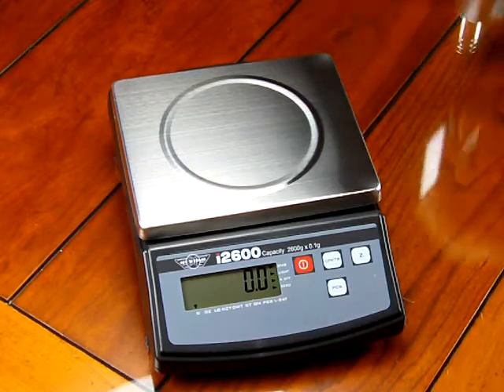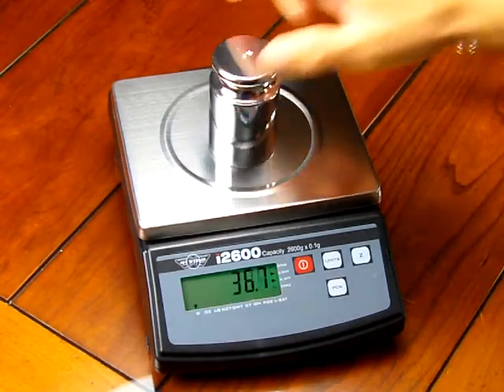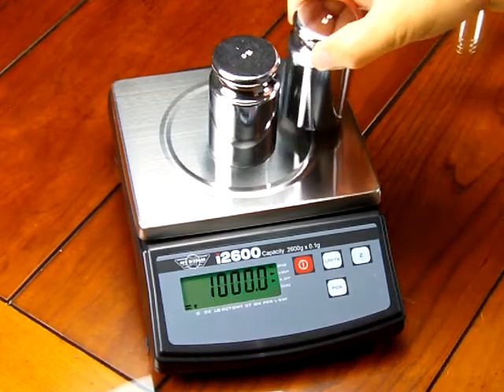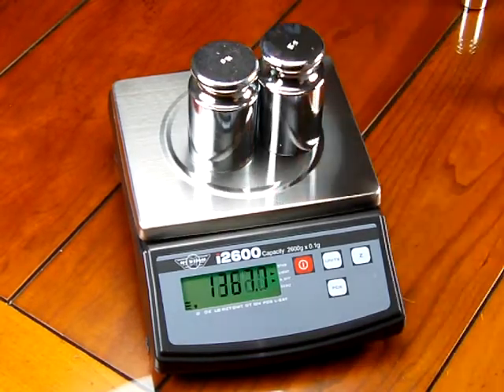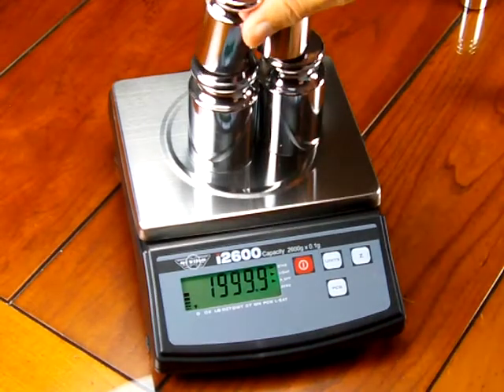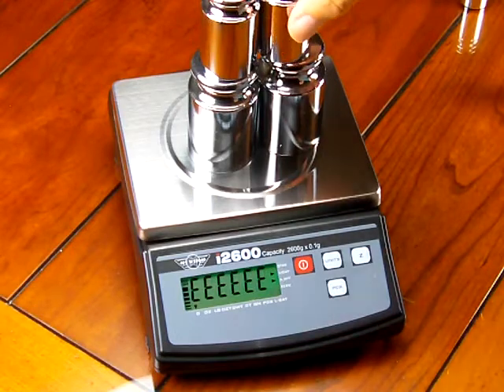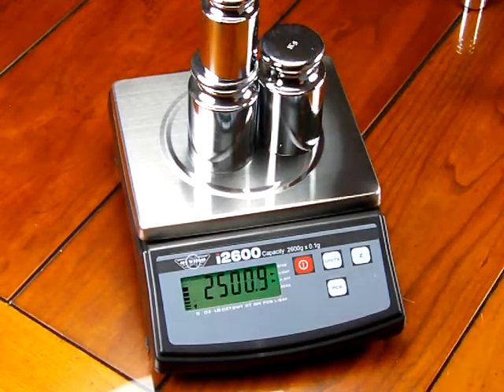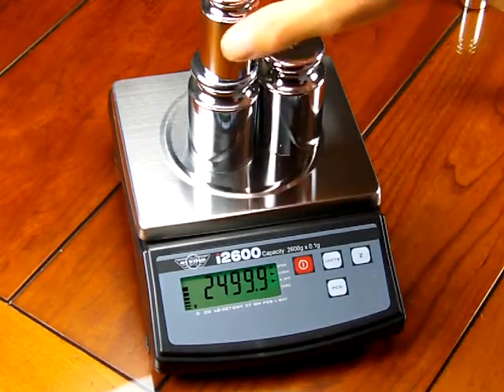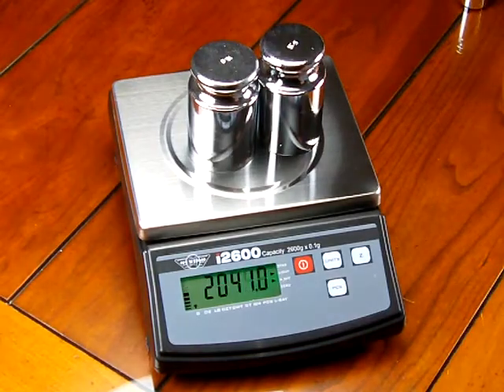The scale offers 2600 gram weighing capacity. So if we were to put on some weights, this scale is right on the money right out of the box. If we put too much capacity you'll see 'E overload.' So we're up to 2500 grams and the scale reads accurately right out of the box.